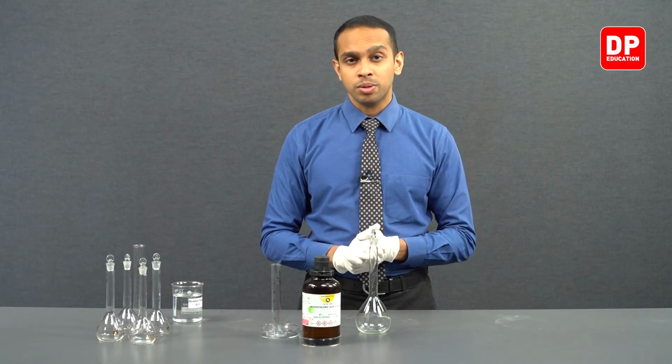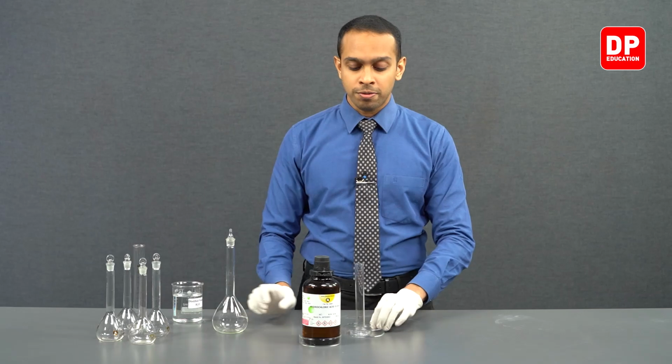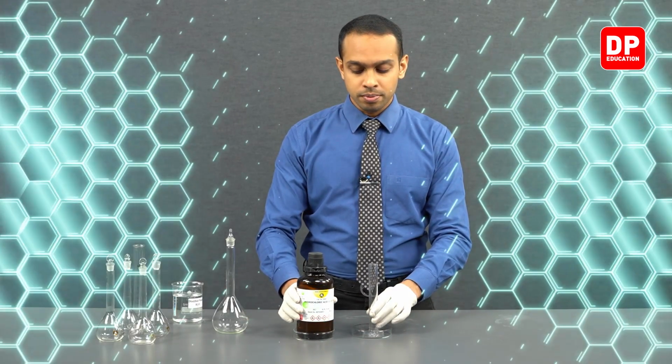So now let's measure 21.5 cubic centimeters of HCl.